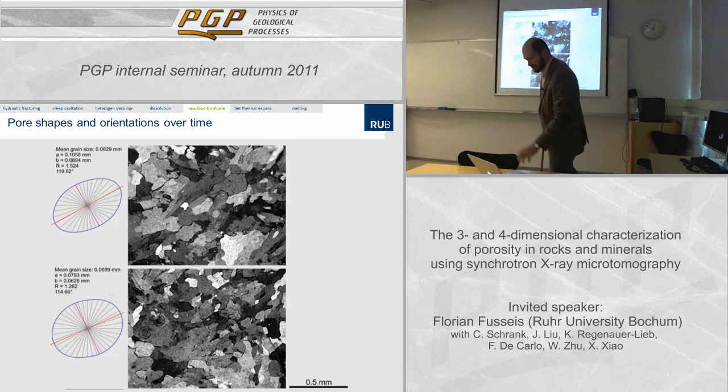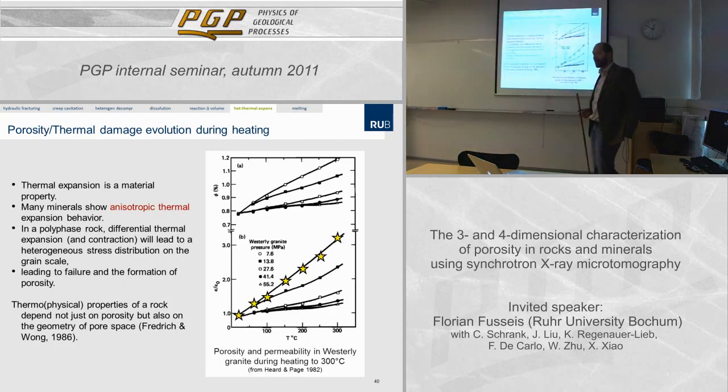I want to conclude with a short outlook on ongoing work. That is a heating experiment that we did with Westerly granite, to investigate thermal damage and porosity formation during heating.